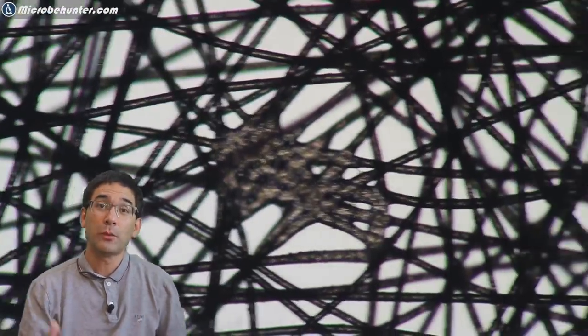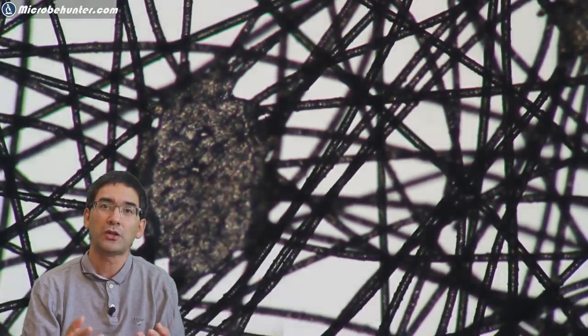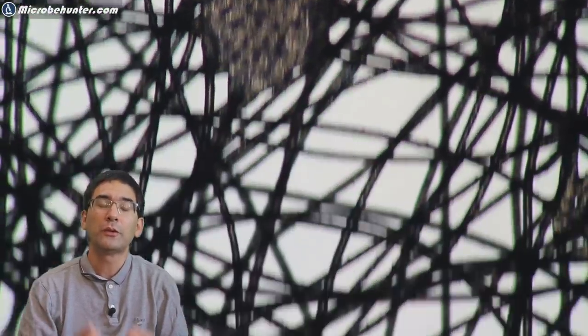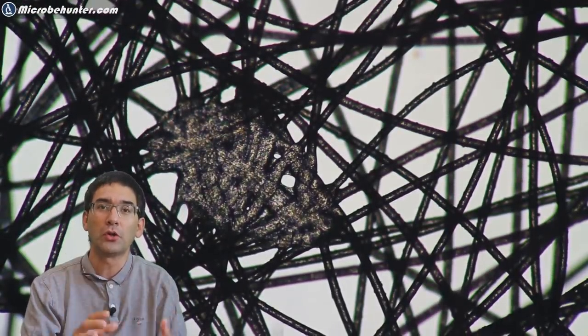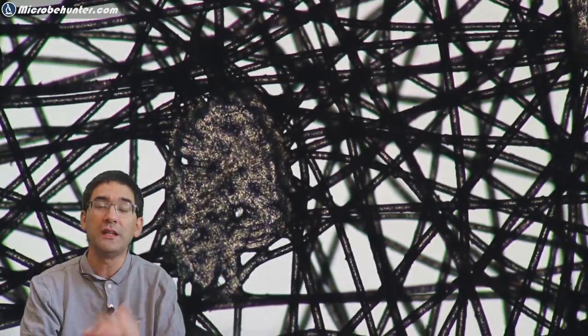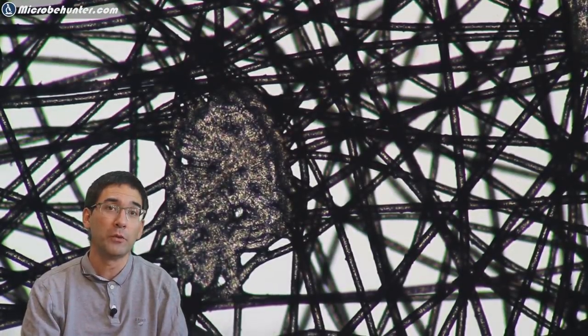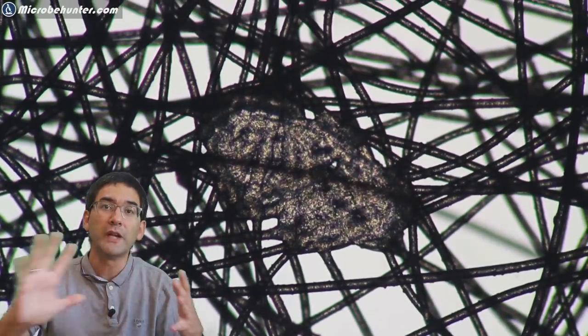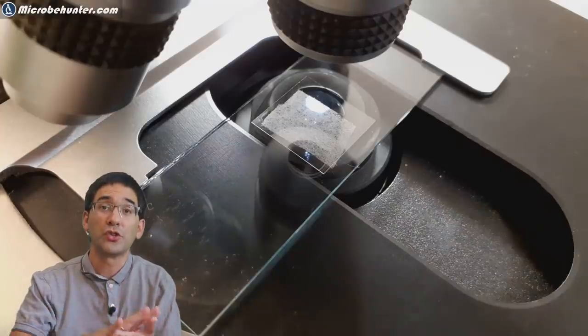In other words, those face masks are actually made of plastic. It's quite interesting to see this. It also shows that the fibers are packed relatively loosely, but still evidently enough to catch the droplets that are emitted when people talk. Those patches were arranged in a very regular pattern, which means that evidently a machine has pressed those fibers together.